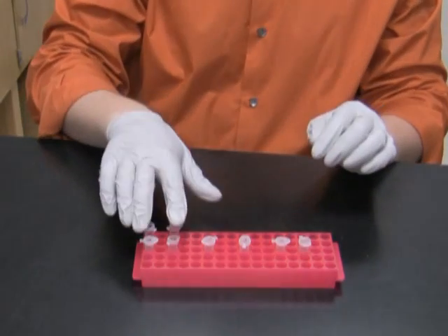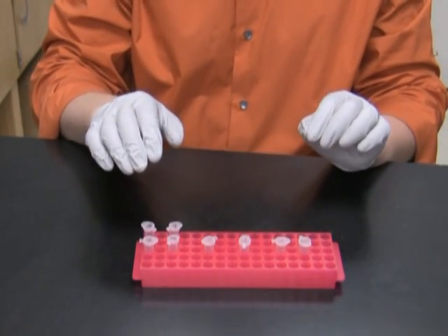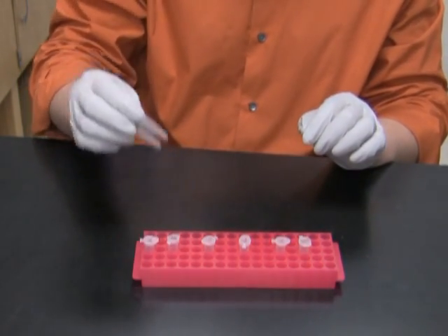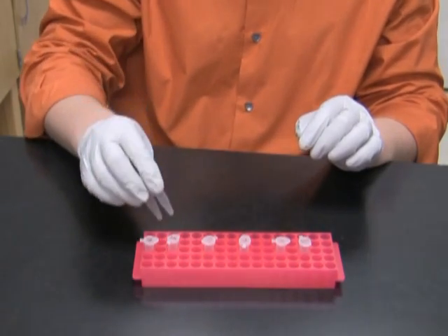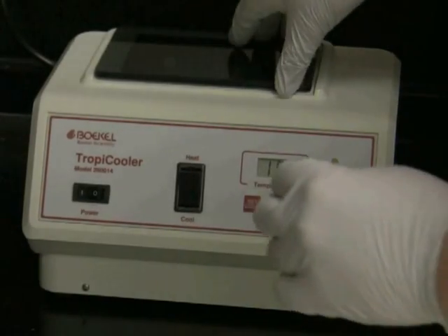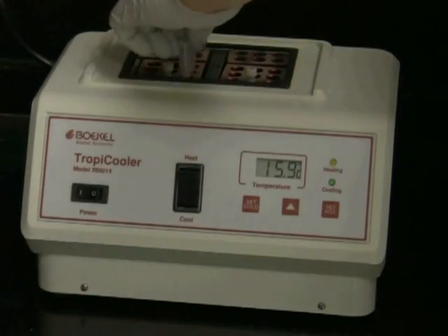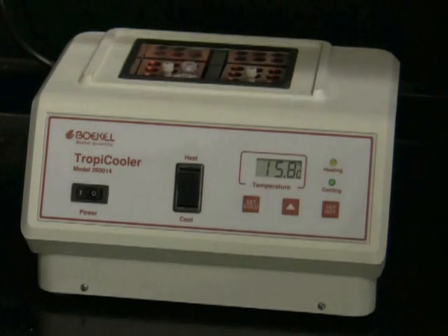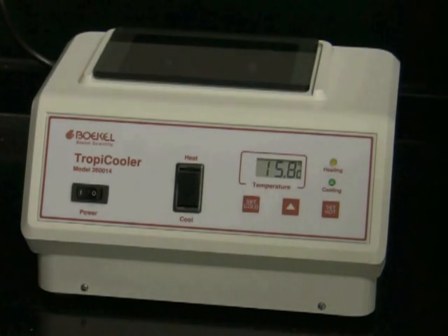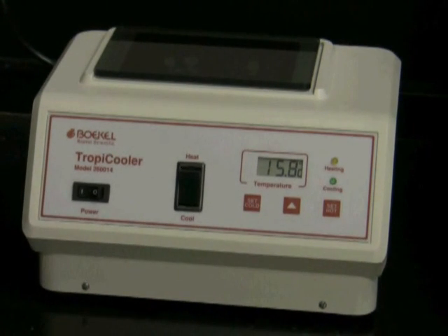I'm going to leave the first set of tubes on the bench for 15 minute room temperature ligation, and I will put the other set of tubes in a 16 degree incubator overnight. If tomorrow I will not get any colonies from the 15 minute ligation, I will repeat the transformation step with the tubes I kept at 16 degrees overnight.